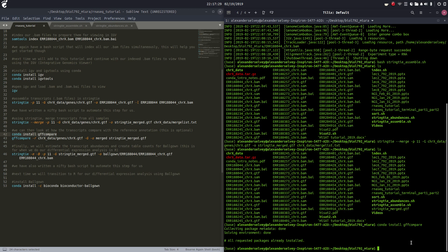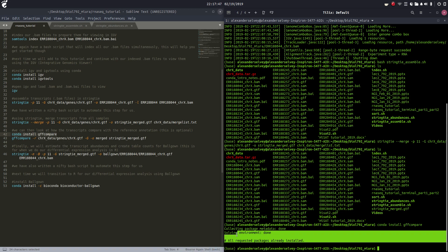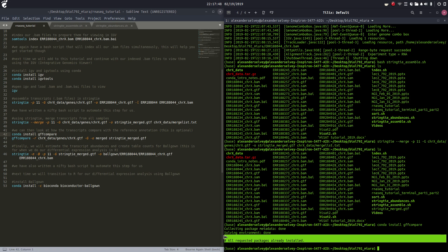All requested packages are already installed. That is a good point to make: when you run these conda install commands, if the package is outdated it will update the version of the package; if it's completely up to date you'll get this message: all requested packages already installed.